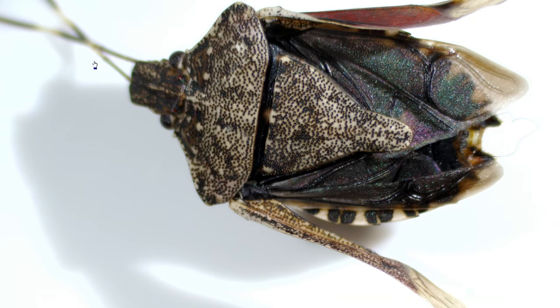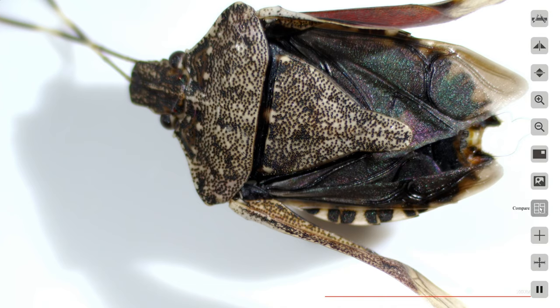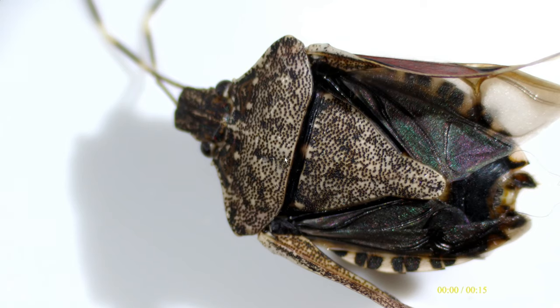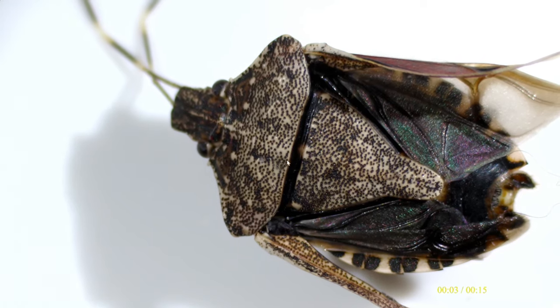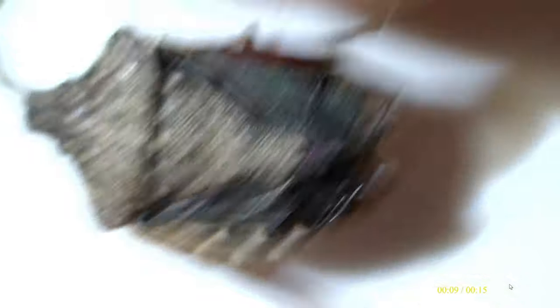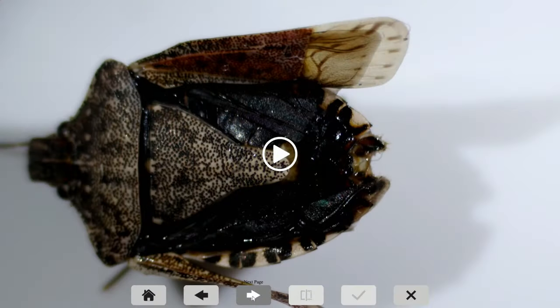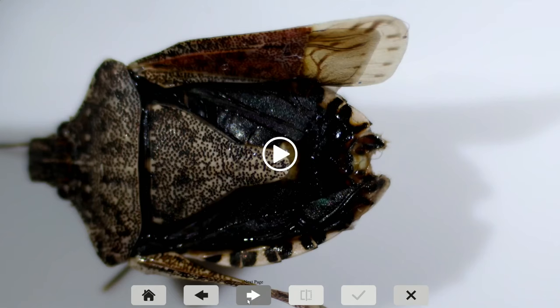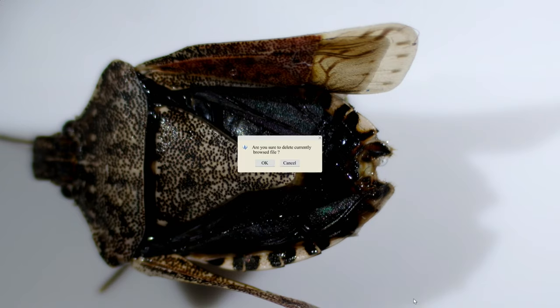There's also a mask feature. I'm going to draw a region of interest — this is great for teaching if you want to outline a certain region. With the scroll wheel inside the box, I can change the size of that box, and if I scroll on the outside, I can change the opacity of the background. Below that we have our browser, which allows us to look at all of the videos and still images that we've captured to the jump drive. Using the arrow icons, I can scroll through the images and videos.